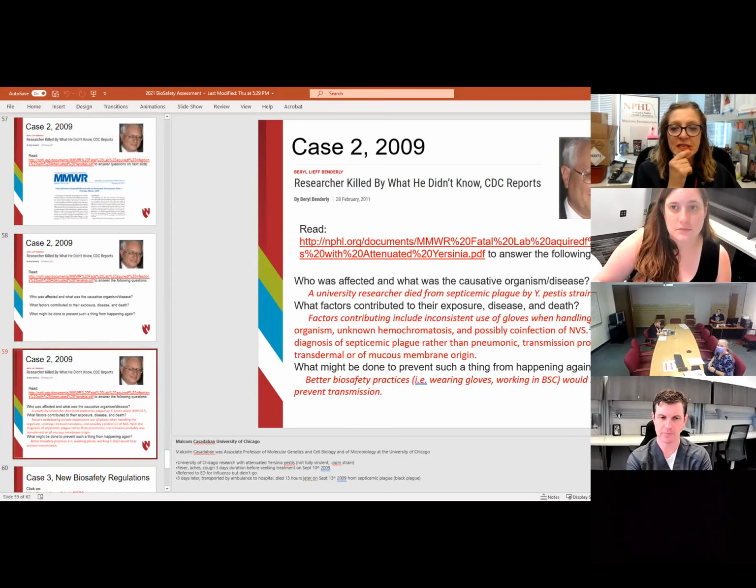So hopefully I answered these all. These are pretty much the answers to these questions, and I'll be sending this out as well. So the biosafety practices of wearing gloves, taking your gloves off after every time or right as you're exiting would help to prevent that transmission.